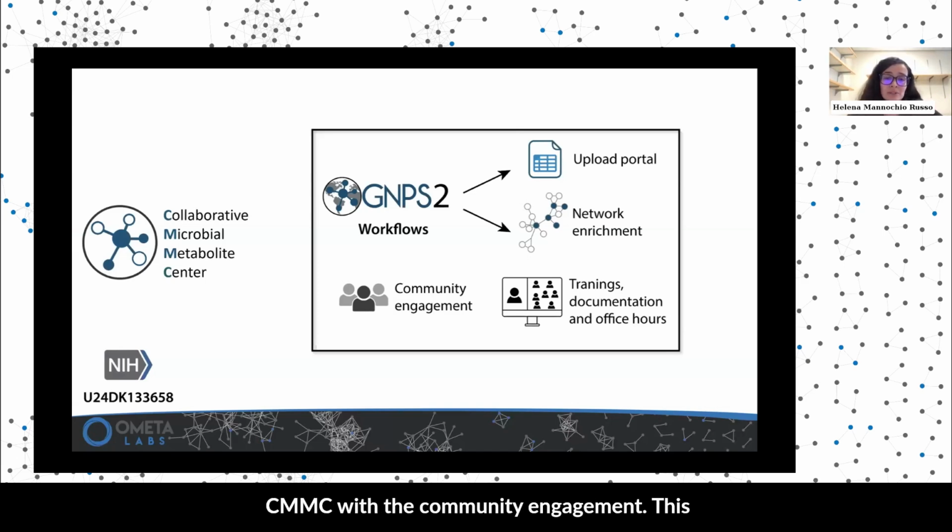So we are building the CMMC with the community engagement. This is a center that is funded by NIH. So we are engaging with the community, and also with some other grants that are funded by NIH that are collaborating with the center. And we are providing several trainings, extensive documentation, and also office hours for people that are willing to contribute to these efforts.